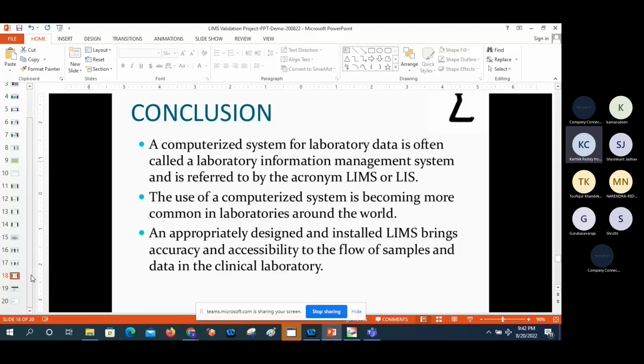Cognizant guys. They are pulling the people from the pharmaceutical organizations who have the real knowledge about the master data, as well as the support of LIMS administration, like how to create the users, how to modify the users, and how to obsolete those users, and how to migrate the data from one environment to another environment, how to install the configured packages which are provided by the vendor. These kind of things are one type of support.